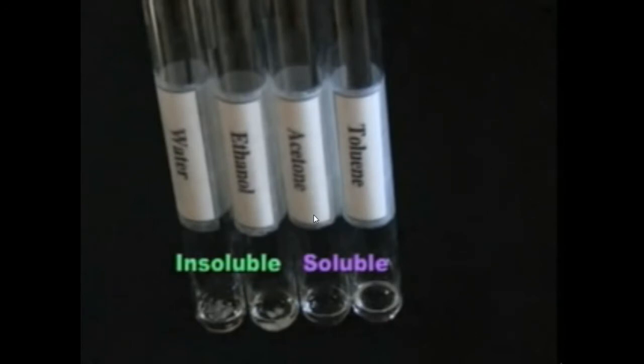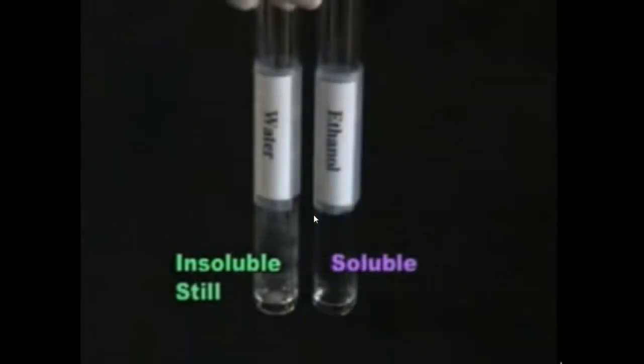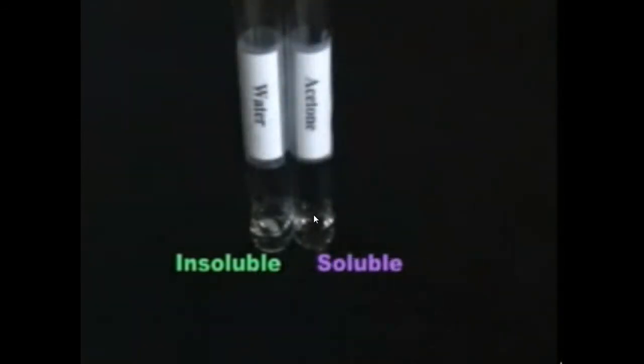Our solubility test shows that naphthalene is soluble in both toluene and acetone even at room temperature. So which one should we choose to be our solvent 1? That depends entirely on our choice for solvent 2. We know from our solubility tests that naphthalene is insoluble in water even at the boiling point. That makes water a very good candidate for solvent 2. While acetone and water are miscible, toluene and water are not. The recrystallization of naphthalene will be carried out using acetone as solvent 1 and water as solvent 2.